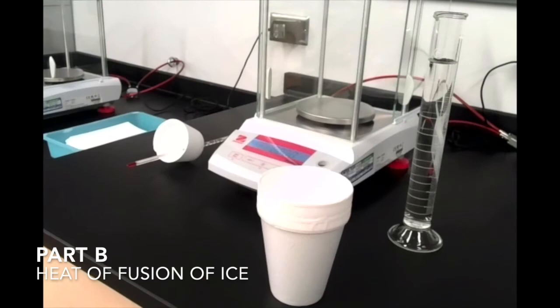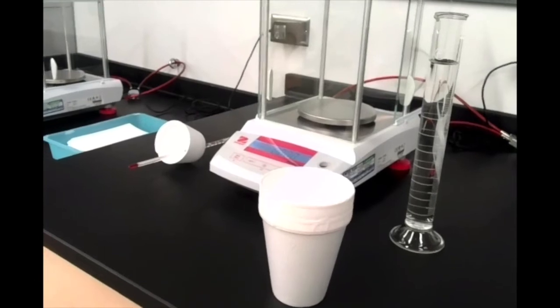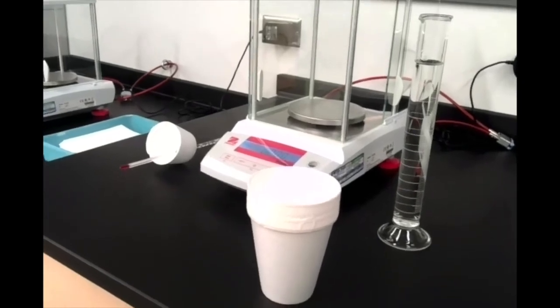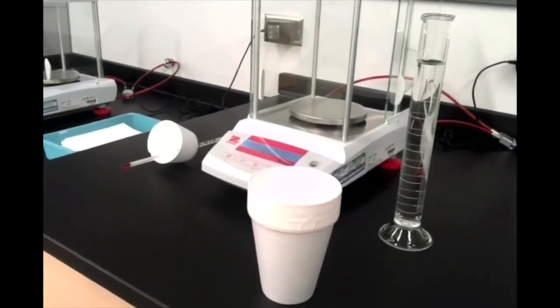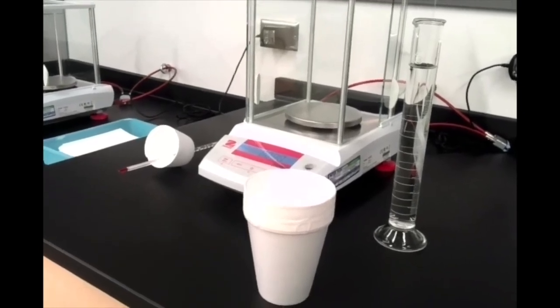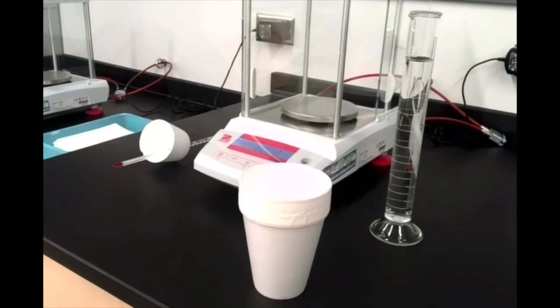In this next part, we're going to determine the heat of fusion for ice experimentally by adding some room temperature water and making a note of the temperature change as the water cools down and the ice warms up.